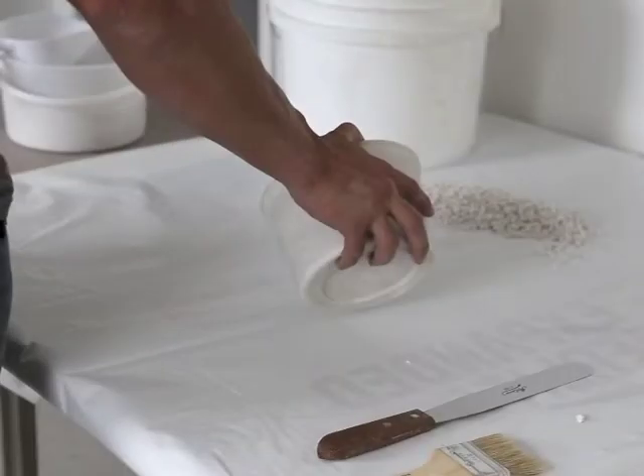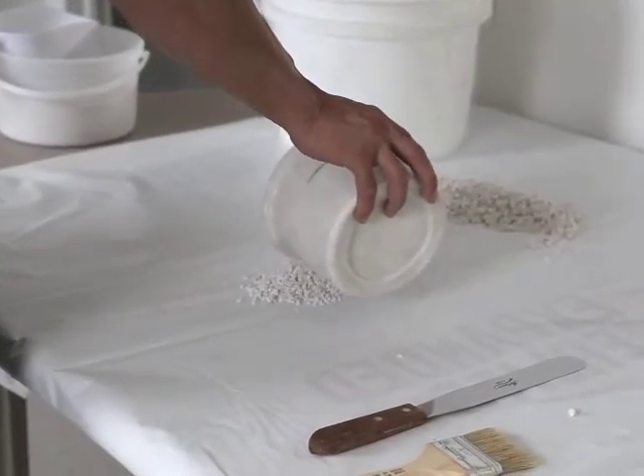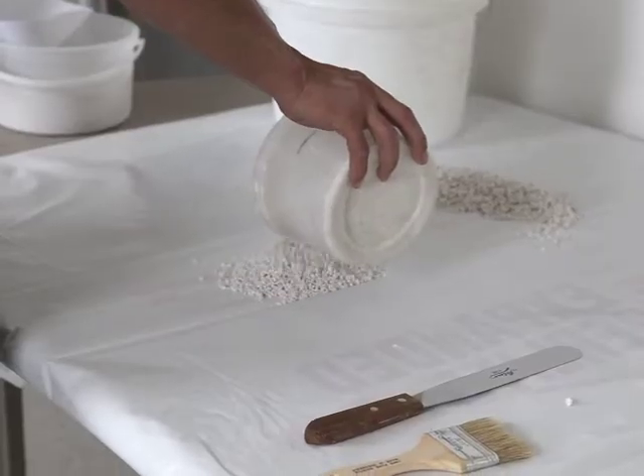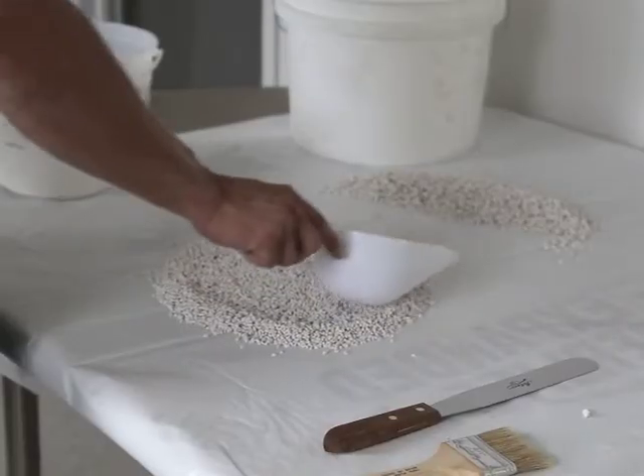Mix again by shoveling the perlite into a conical pile. Do that by taking alternate scoops or shovel loads from the two quarters saved, or combine remaining quarters into a bucket and make another conical pile.